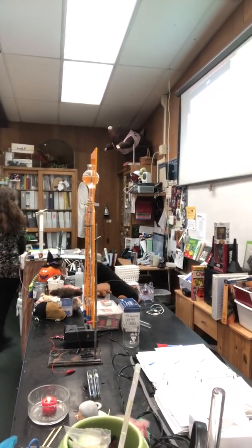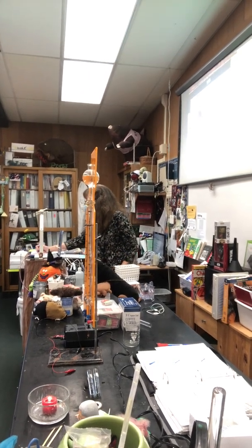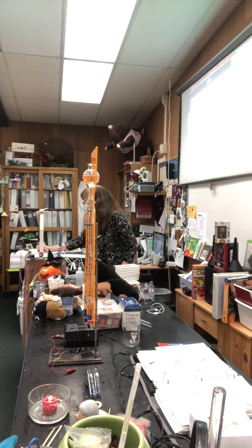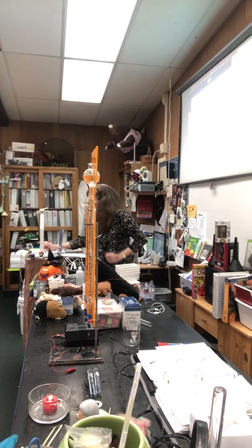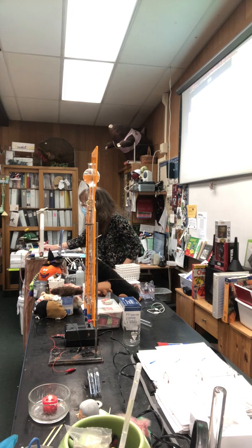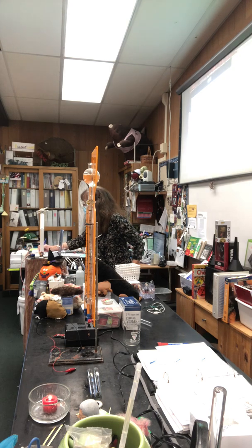Okay, so tomorrow's lab we're going to be splitting water, and the fancy term for splitting things with electricity is electrolysis. So the electro part, hopefully self-explanatory, has to do with electricity. And you know from biology, lysis has to do with splitting. So we're going to use electricity to split water, and because water is so important and because this process is important, it has its own name.